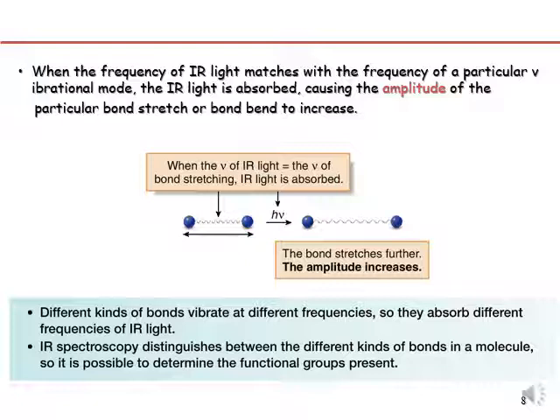That's why in infrared spectroscopy, we can easily identify if the molecule has a single bond or double bond. This is very important. The characteristic of this can be differentiated in the output of IR spectroscopy.